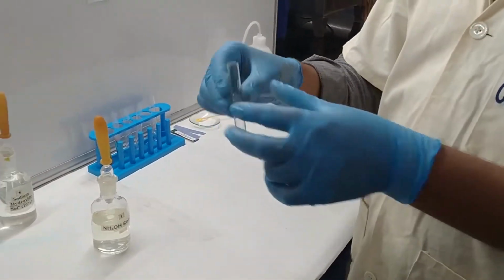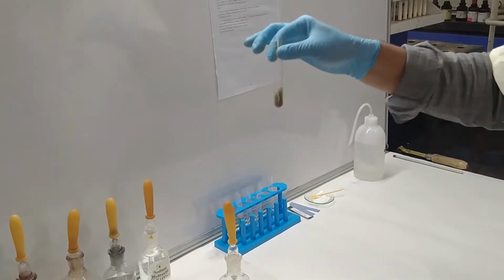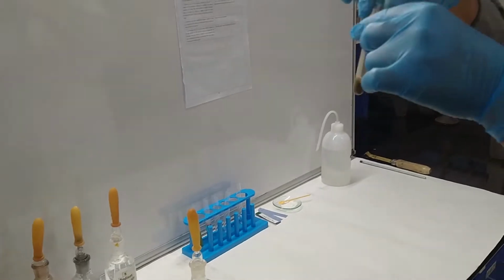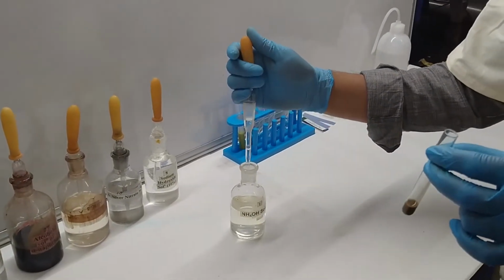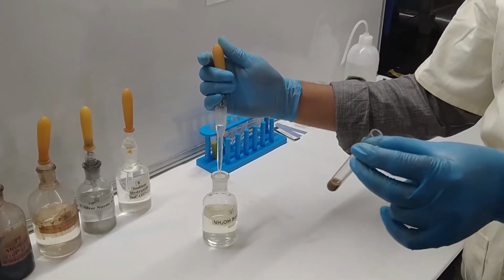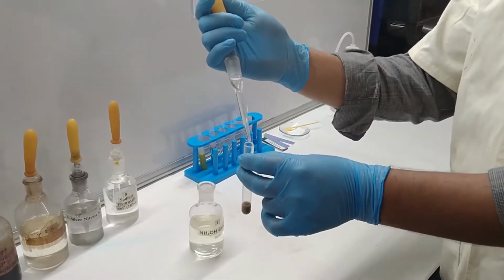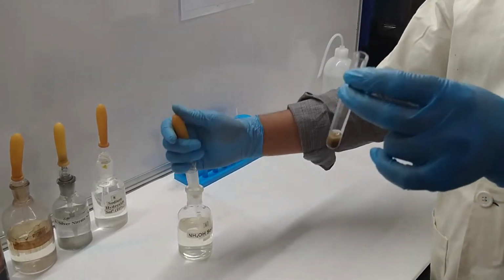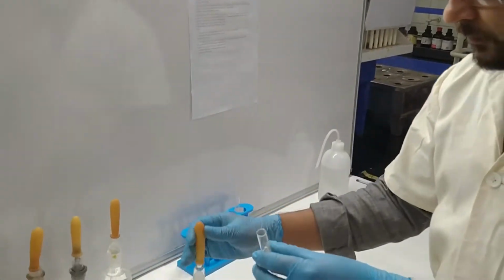So always you have to take care of this one, no extra NH4OH added into the test tube. That is why I am adding drop by drop. Again I added 3 drops. Now again I am taking this one, this also.